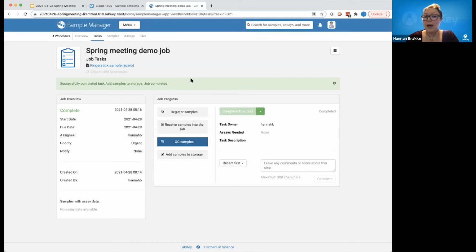But we're not disallowing delete from those admins, right? So I think we would want to talk about what the needs for that are, because it's a very interesting use case. And maybe later this year on my roadmap is to determine how we might have a more advanced permissioning model as well.